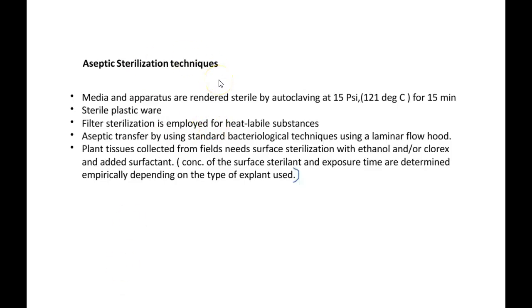In aseptic sterilization techniques, media and apparatus are rendered sterile by autoclaving at 121 degrees centigrade for 15 minutes. Sterile plasticwares are used. Filter sterilization is employed for heat-labile substances, while aseptic transfer is conducted using standard bacteriological techniques with a laminar flow hood.